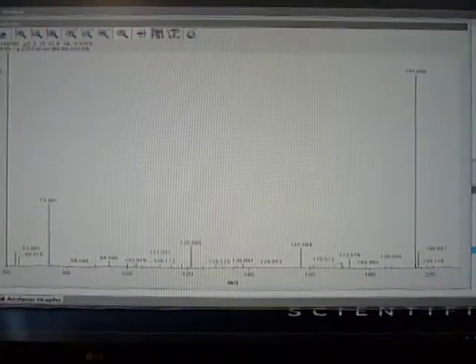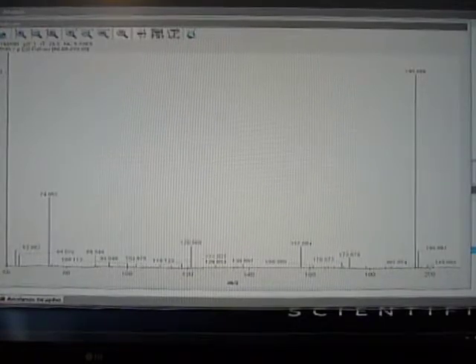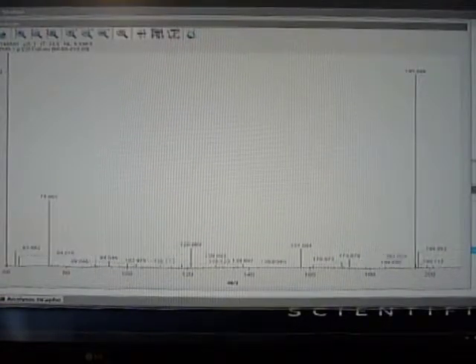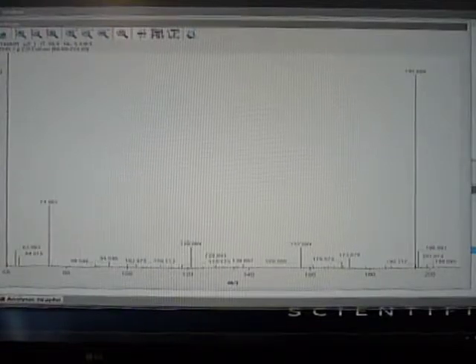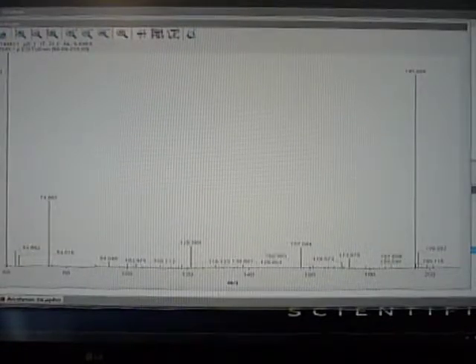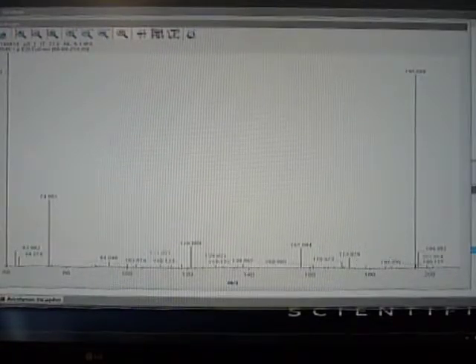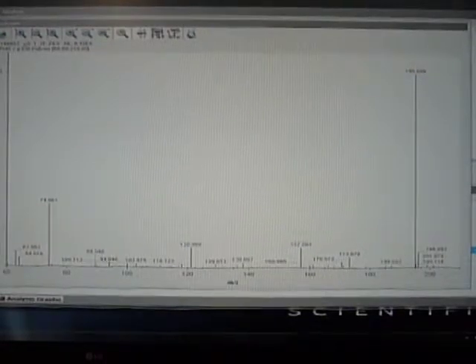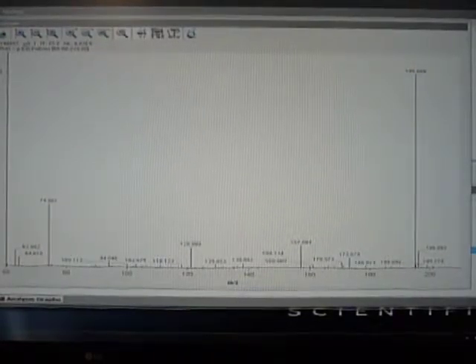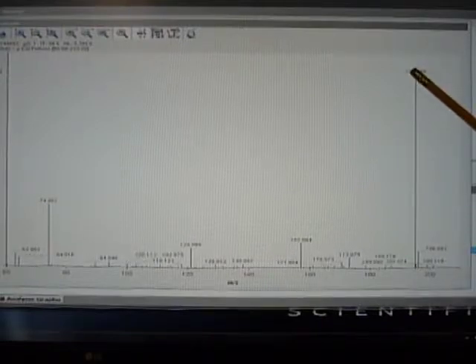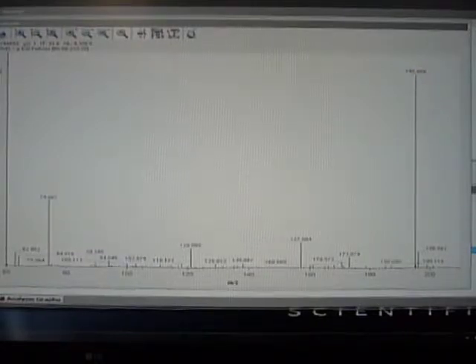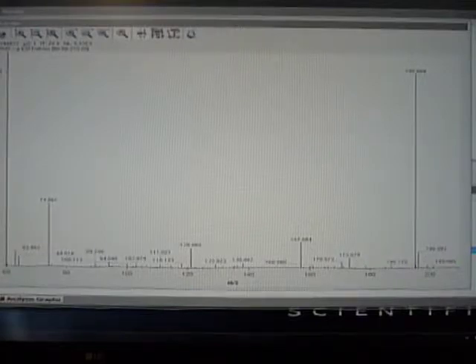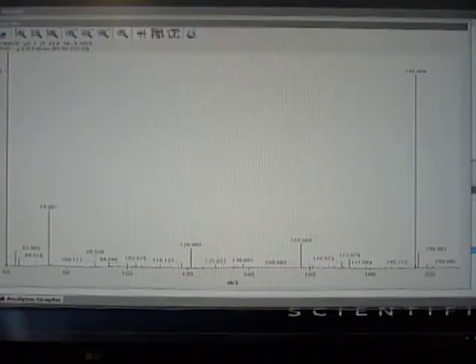So that's a flow of 120 nanograms per minute of caffeine to the mass spec source. Now this is positive electrospray, so here for caffeine we have the M plus 1. And the spray voltage is 3.5 kilovolts.